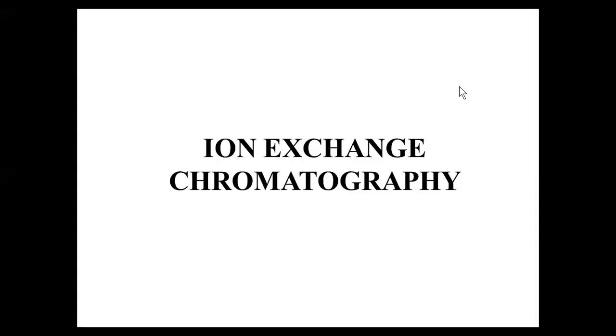Ion exchange chromatography is a very important separation technique which is used for the separation of ionic solutes, where the ionic solutes will be having affinity towards a charged ion exchange resin. The resin may be cation exchange resin or anion exchange resin. If the resin is cation exchange resin, the separation will be for cations, and if the resin is anion exchange resin, anions are going to be separated.